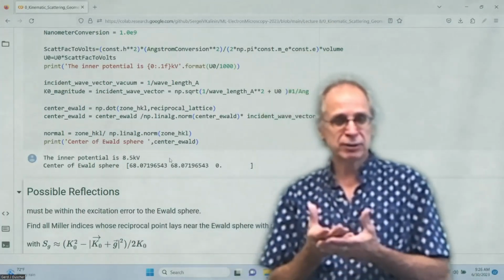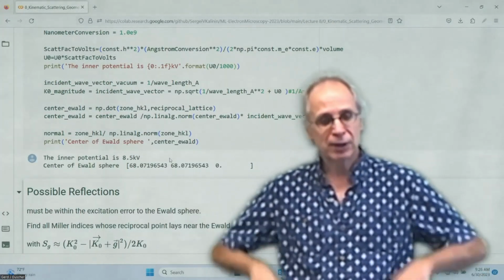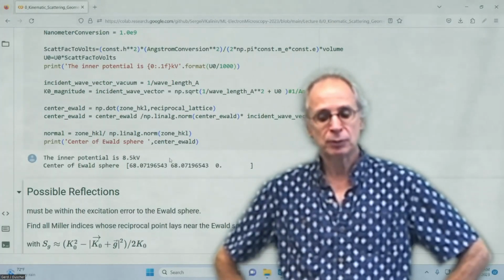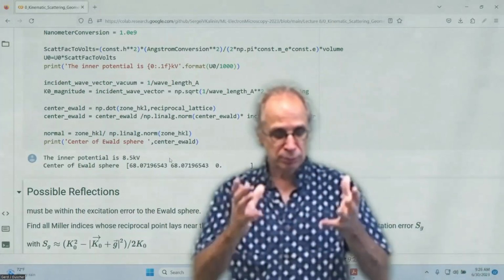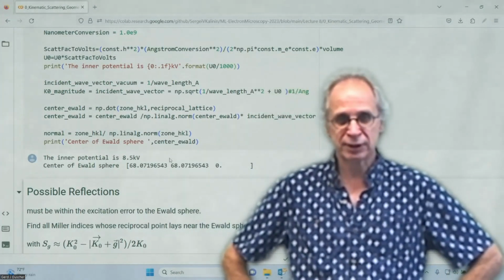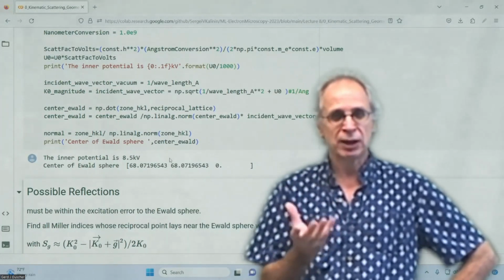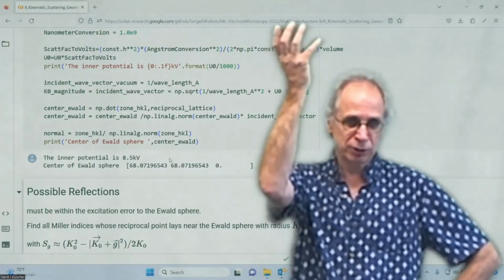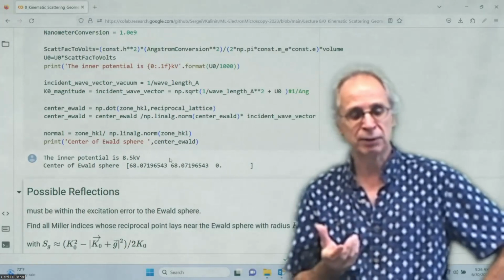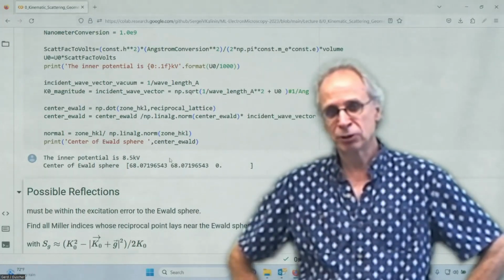Now, the electron sees all the nuclei shielded by the inner and outer shell electrons that these atoms have, but the potential it sees is actually positive. That means our electrons get accelerated within the samples. Okay. We are already at 3/4 of the speed of light.